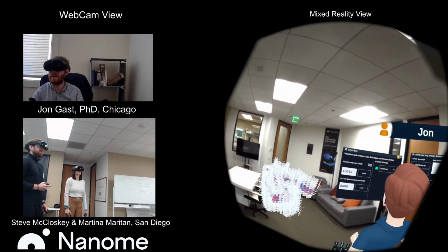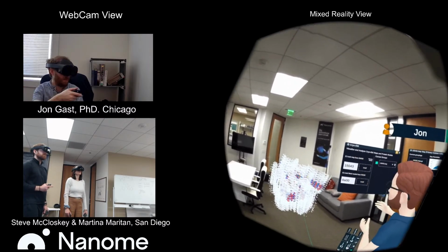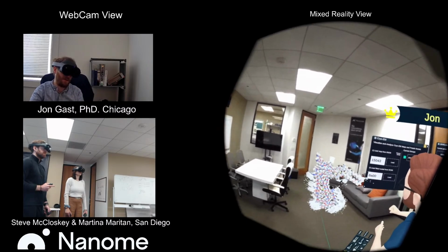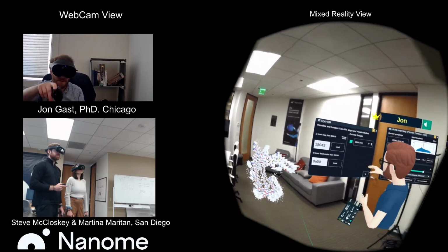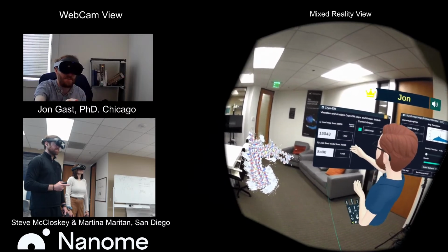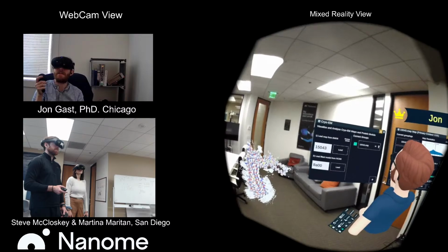Absolutely. And we're going to be looking at one here within the cryo-EM. We'll do a little bit of review of how we brought this in and took a look at this. Here we can see the starting point. We're going to need to find an EMDB map, and then from there, bring in the protein model that's associated in this case.